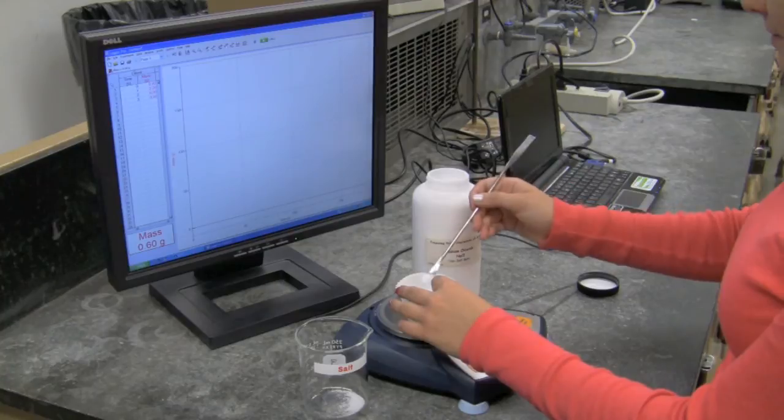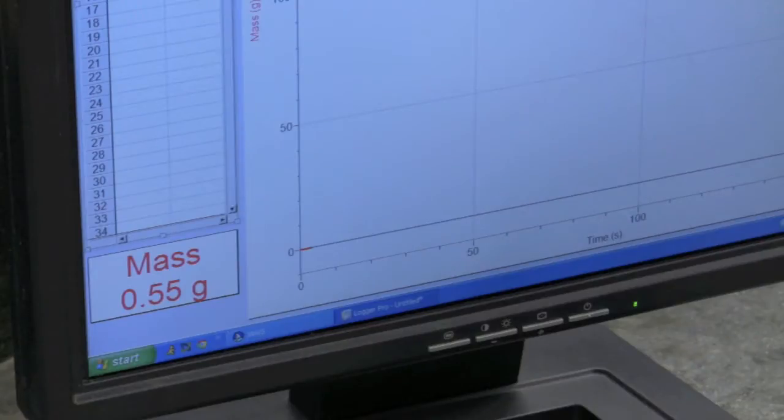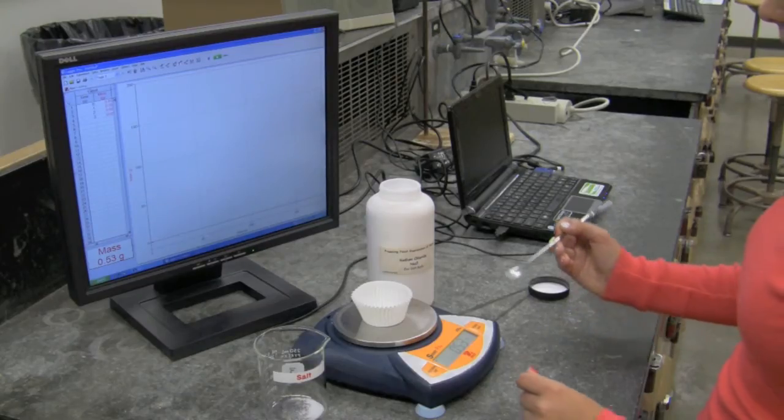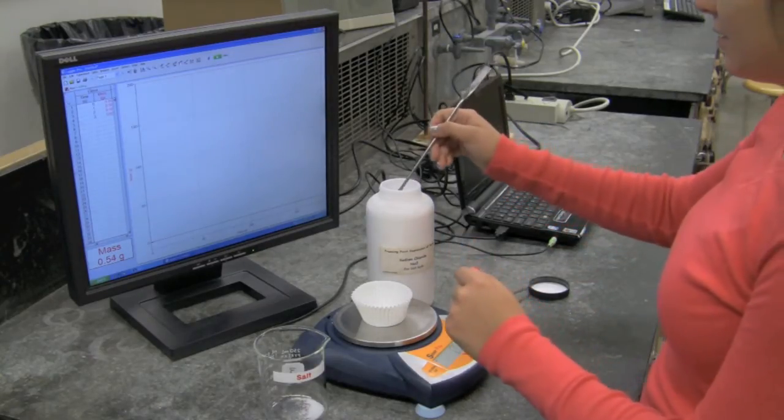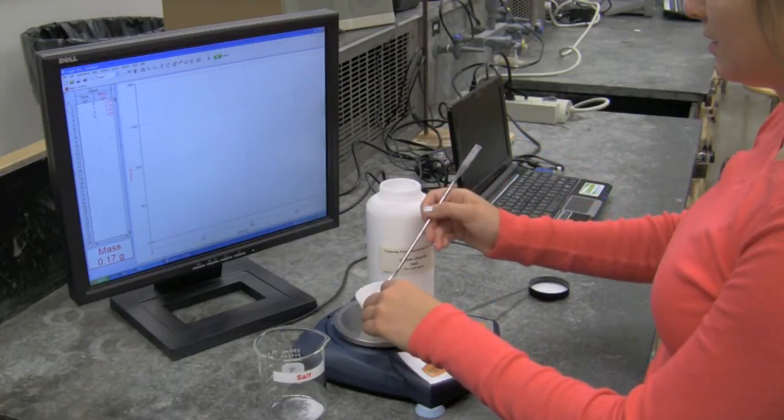The student is scooping white salt from a large container to her right. 0.36, 0.55, 0.54. She's pouring the scoop of salt into a weighing boat on a balance in front of her.